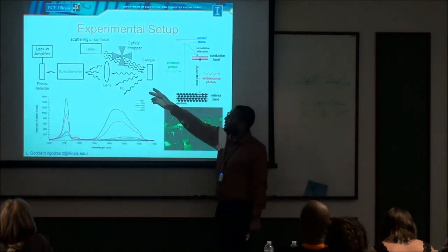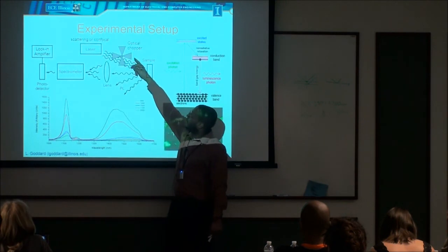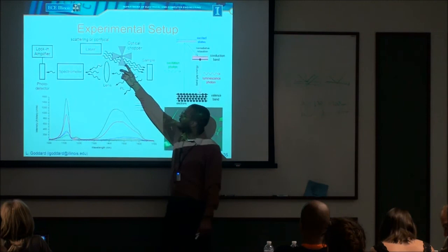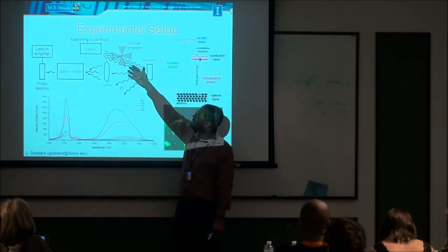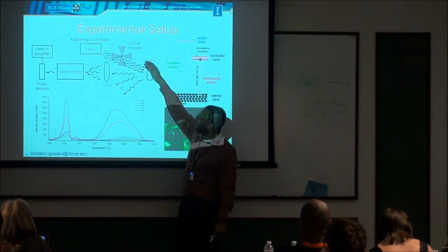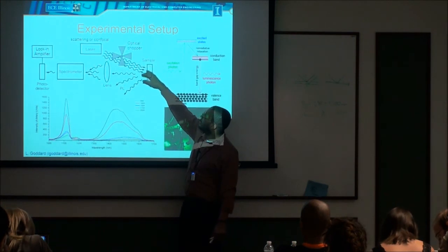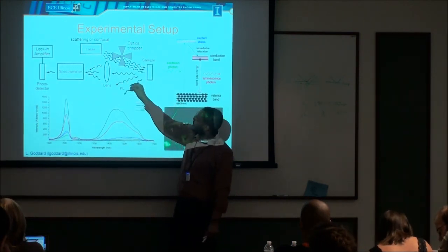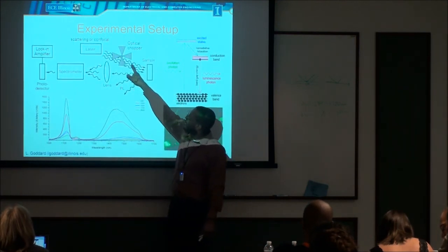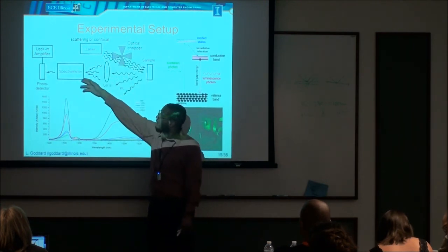This is a typical setup for what photoluminescence looks like. I have a light source, and again, you will chop the signal. The reason you have to chop the signal is, let's say I send my light source at 400 nanometers. It hits the sample, and then it starts emitting at 1100 nanometers to 1500 nanometers, depending on what sample it is. The emitted light goes in all of these different directions, uniformly emitting in multiple directions. Your laser signal may bounce back, and there may be some scattering from other things that make it to your detector.